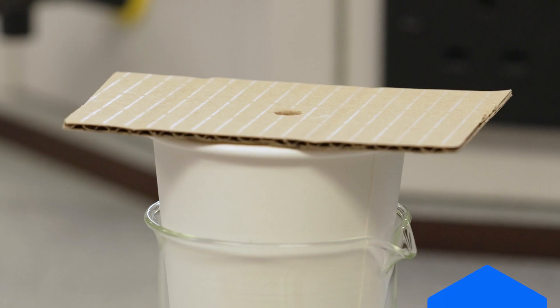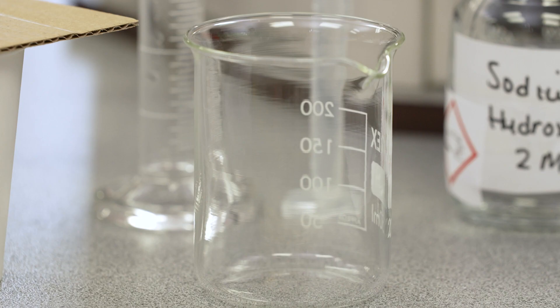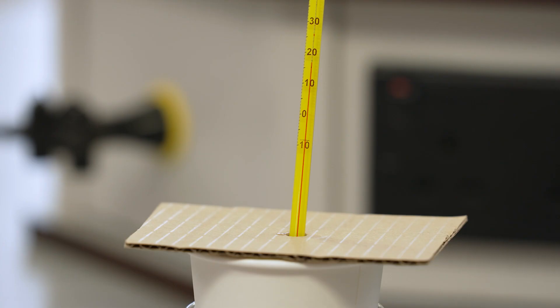Place the lid on top of the cup. The lid should have a hole in it to accommodate the thermometer. The measuring cylinder should be thoroughly rinsed. Using the thermometer, measure the starting temperature of the acid and record this in a suitable table.